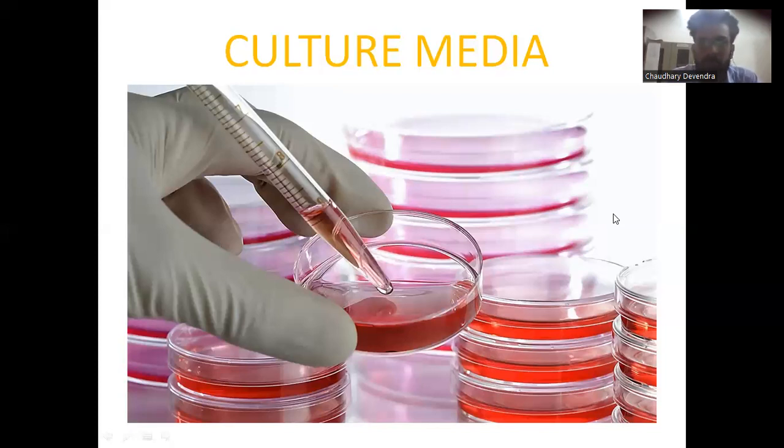We'll discuss the types of culture media, the uses of culture media, and their compositions. Why we say this is indicator media, this is enrichment media, then this is enriched media, and why this is selective media, and what is the importance of selective media. We will discuss one by one. So let's start.